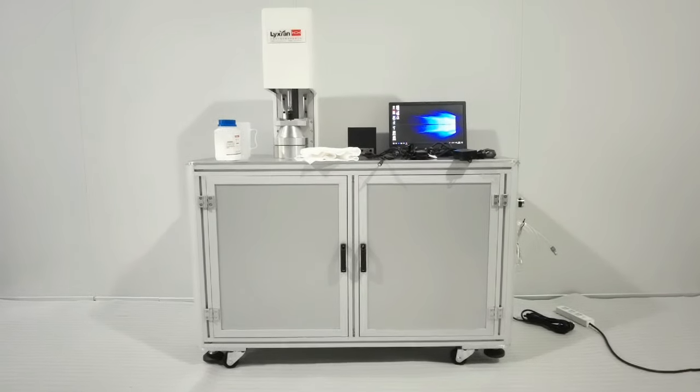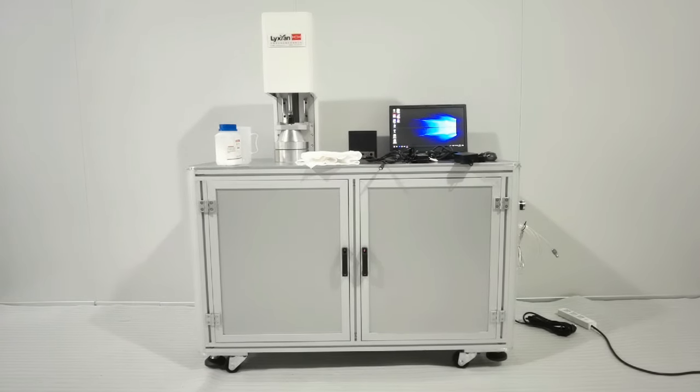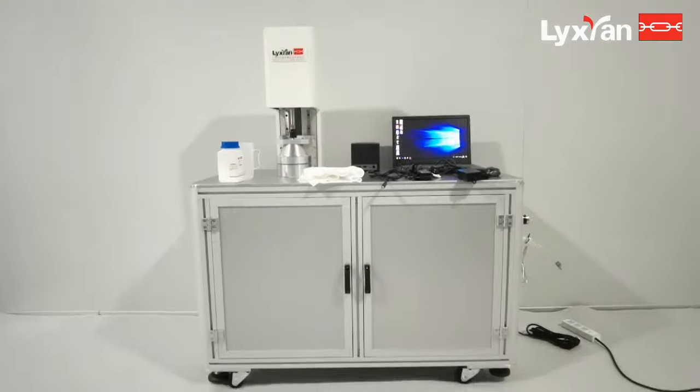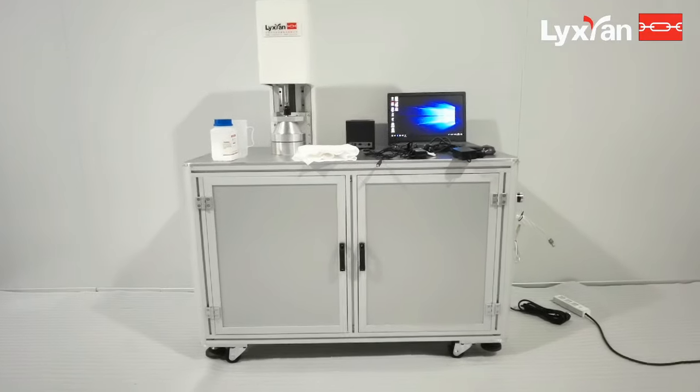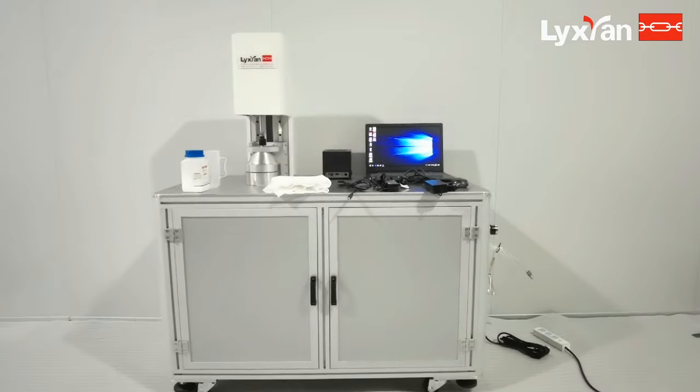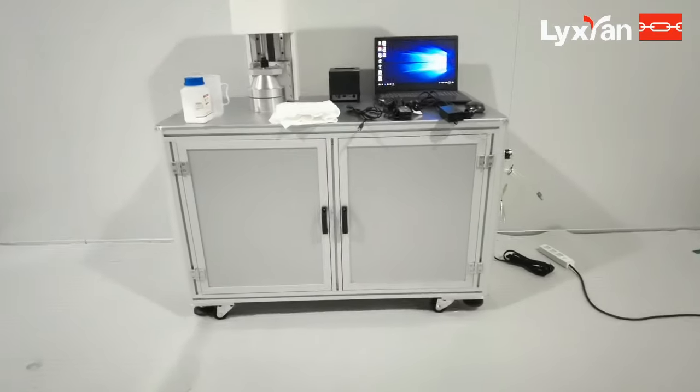Hello everyone, this is a PFE machine. Now we start to tell you how to use the machine when you receive it.